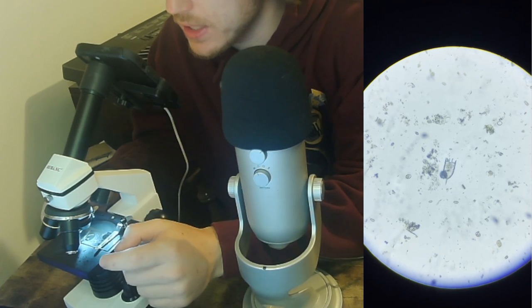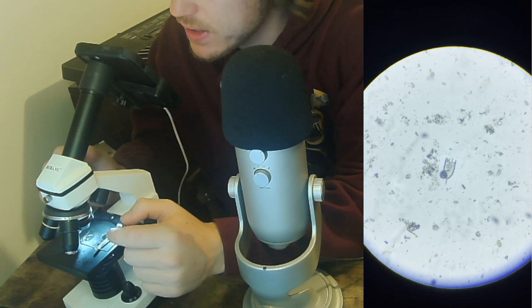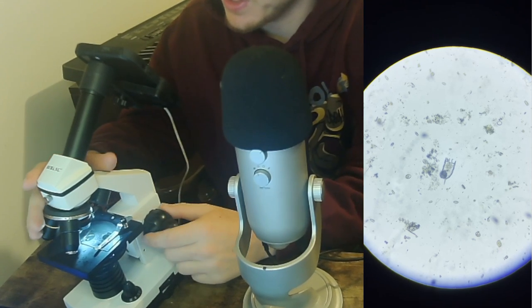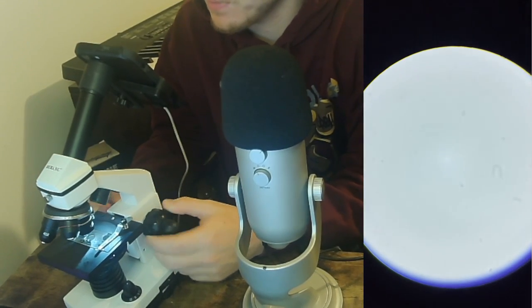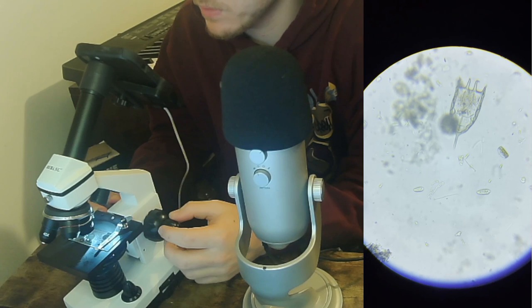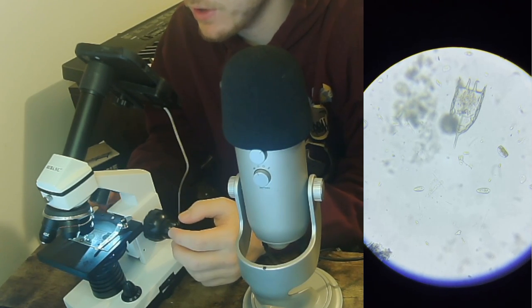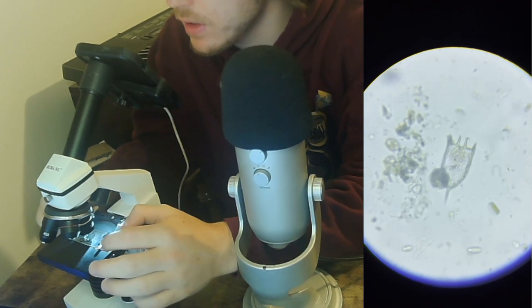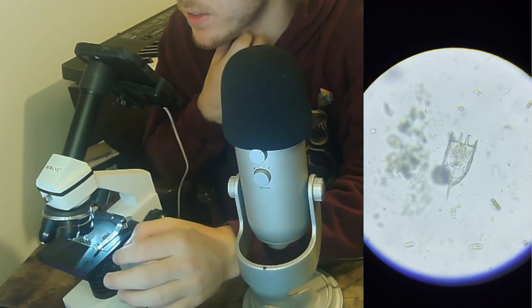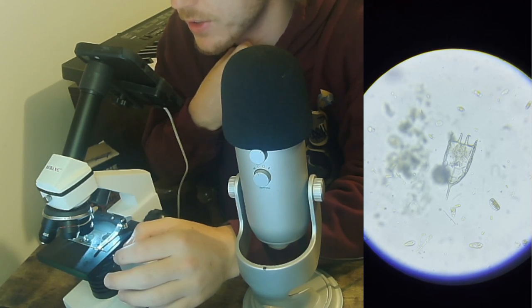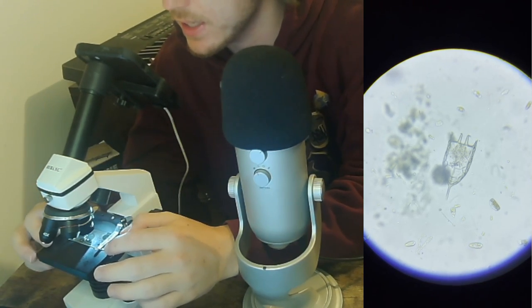He sort of looks like the vorticella but he has like teeth on his front. I guess he's not totally attached to a stalk. It's very interesting. Let's get closer to him. That's a very interesting little guy that I have not seen before. I am really not sure what he is. Maybe someone in the comments will know. That's a very interesting thing I've never come across anything like that before.